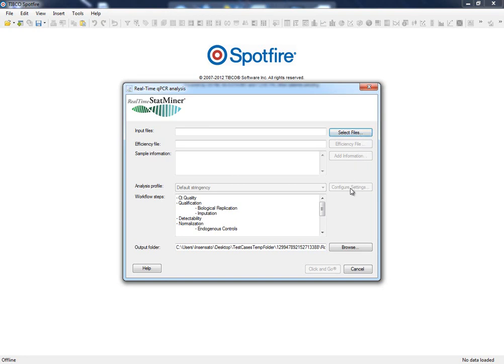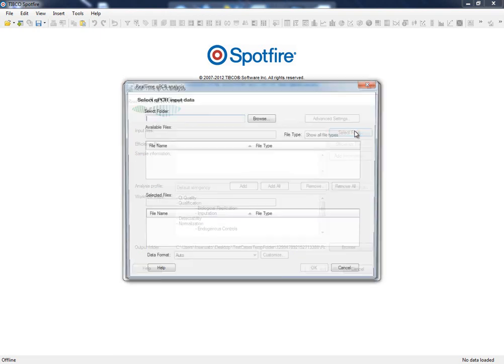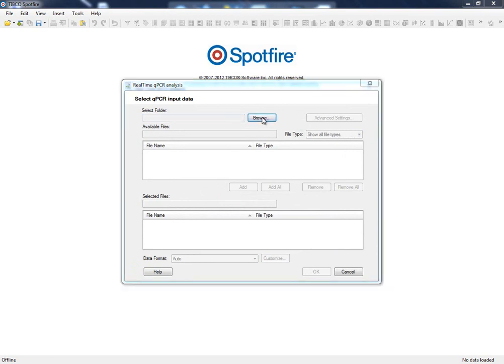In this tutorial, we are going to be focused on the data loading and what to do when the application is unable to automatically recognize our qPCR files.